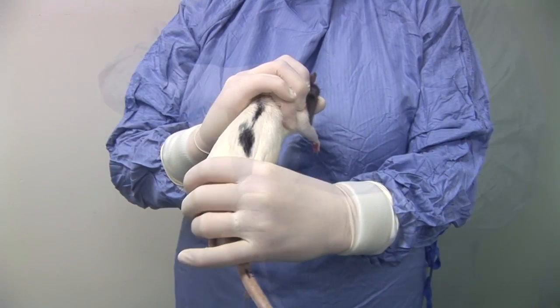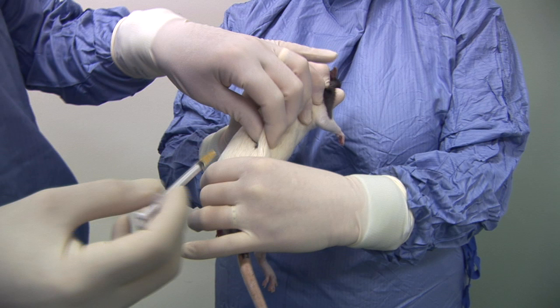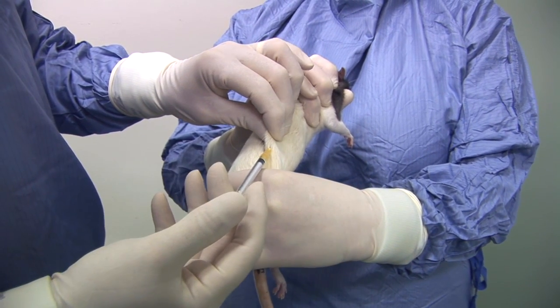An assistant who will carry out the injection tenses the loose skin on the flank overlying the lower part of the back and abdomen. The injection is made under this loose skin, directing the needle into the base of the tented skin so that inadvertent injury to your fingers with the needle is avoided.